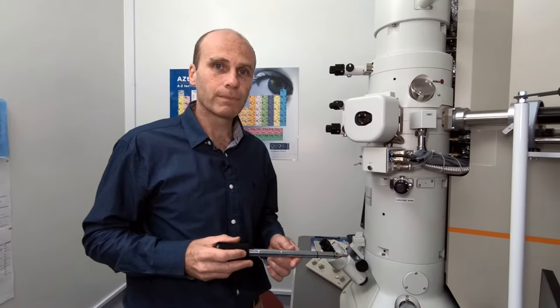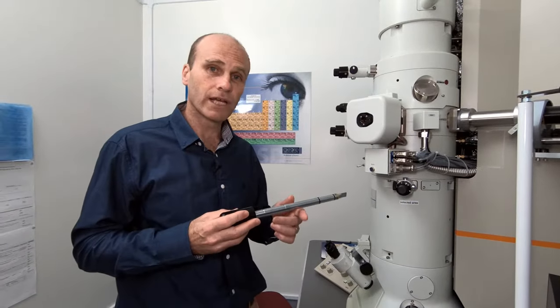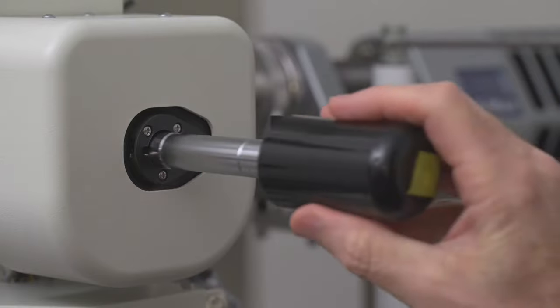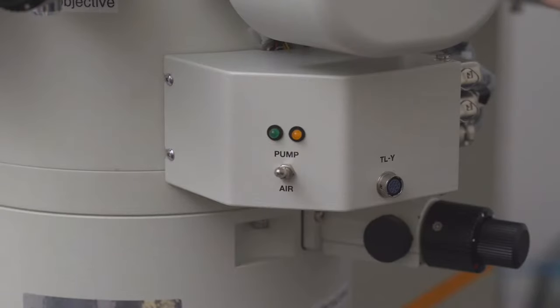So now we'll load the sample into the microscope. In order to do that, we have to put it into the airlock and then pump the airlock down, so that the sample itself is at the same vacuum as inside the microscope. Okay, so we've loaded the sample into the microscope.